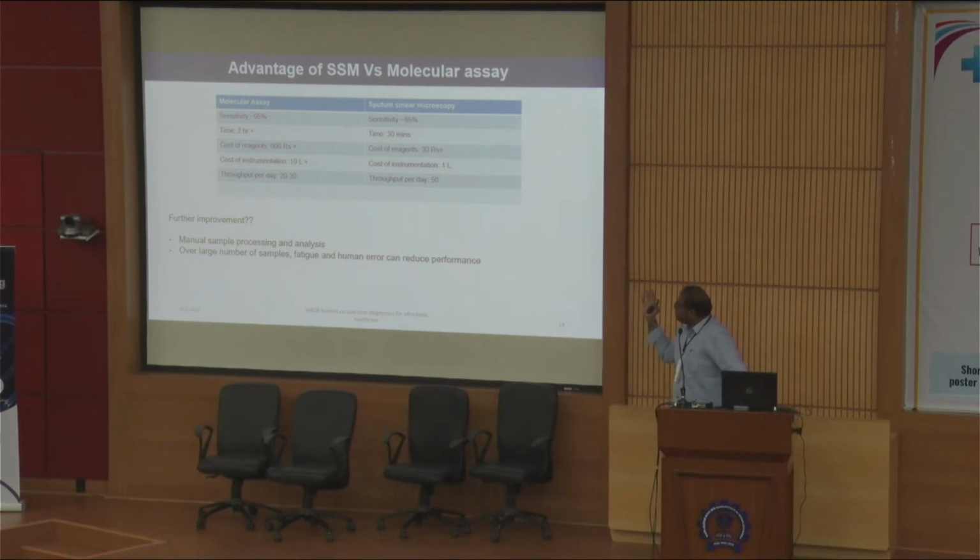So that's where we still think that microscopy-based TB diagnostics have a utility. If you compare the sensitivities at 85, we are working to improve it further. But the cost, turnaround time, and the existing infrastructure, all of it makes a convincing case. There is a good utility for microscopy in the TB diagnostic space. So again, this is our story done till a couple of years back.